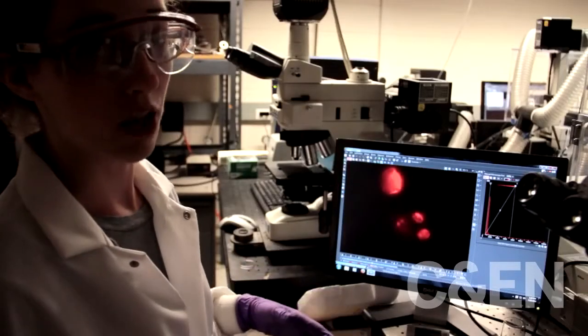Right now, we are looking at images of the cells, cancer cells, that have been targeted by quantum dots. And this fluorescence, or glowing, is the quantum dots attached to the cell membrane.